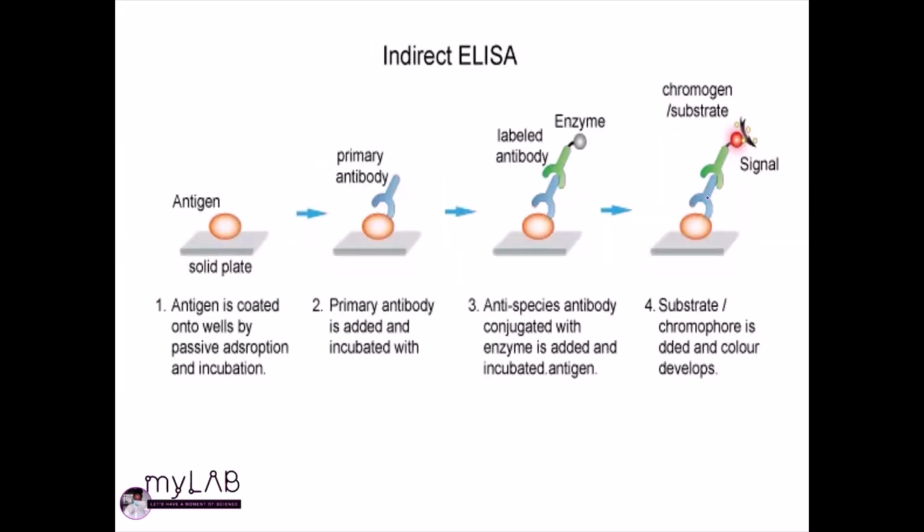In the indirect type of ELISA, we have our solid plate coated with an antigen, and this antigen we can still use HIV.